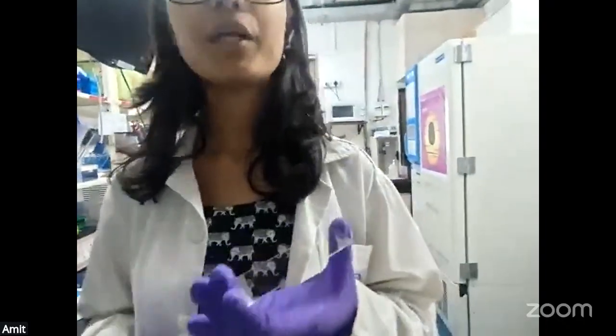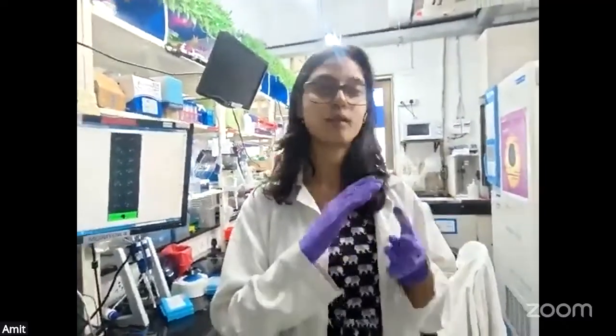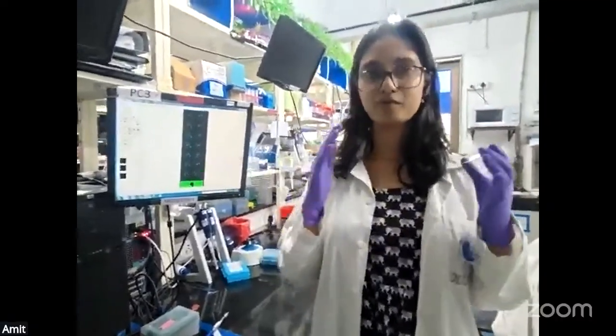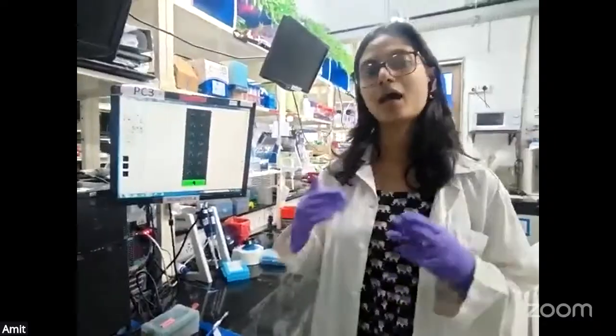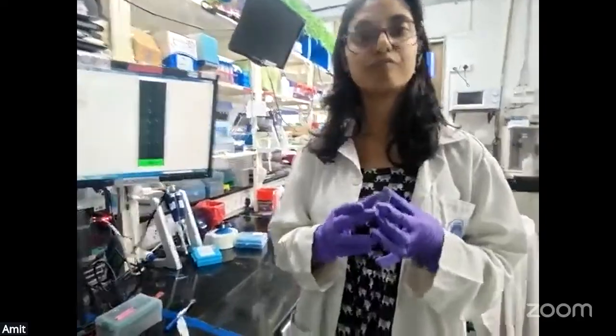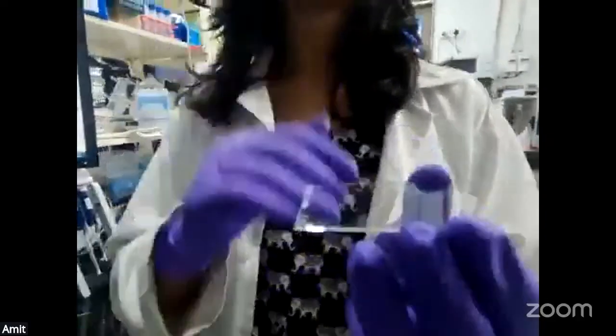Basically, what we do is immobilize different kinds of biomolecules here, proteins, peptides, or even DNA, and that is what gives it the name. If we immobilize protein, it will be termed a protein microarray, and if we immobilize genes, it will be termed a DNA microarray. So this is the chip we prepare, and we scan it, and then we do data analysis. Now let me go through step by step from sample preparation to slide preparation and how we do the data analysis. So first of all, we prepared this slide, as you can see here.